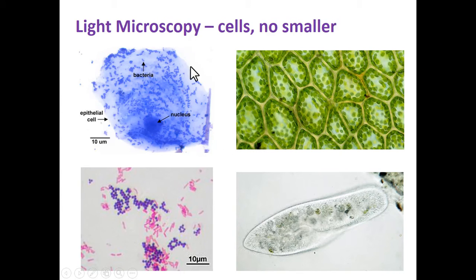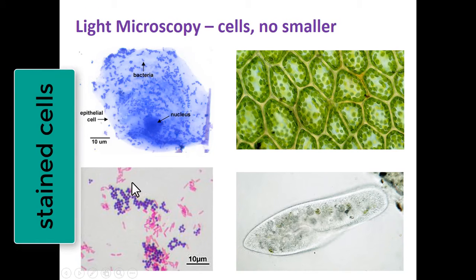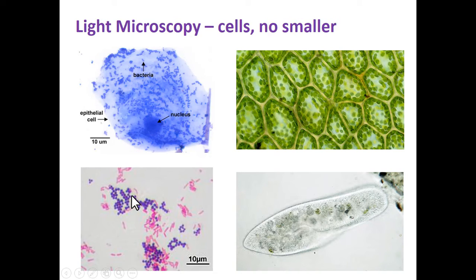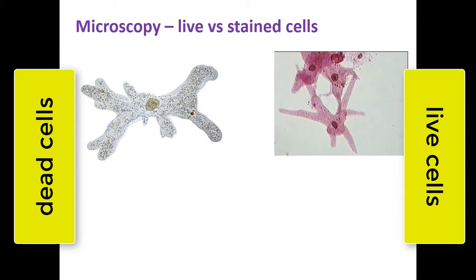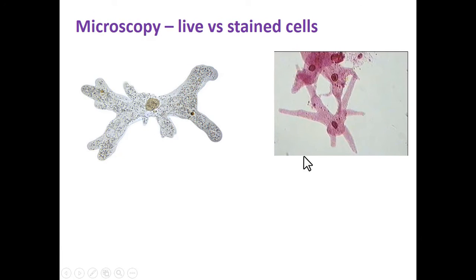Remember, anytime that you stain a cell — such as this cheek cell or these bacterial cells, and there are a whole bunch of bacteria on this cheek from the person's mouth — you have to fix the cells. You have to kill the cells. So you cannot see live cells when you're doing staining. Here's an example of an amoeba — this would be a live cell under regular light or bright field microscopy, and here is a stained cell. These amoebas are dead; they've had dye added to them so that you can see them better.